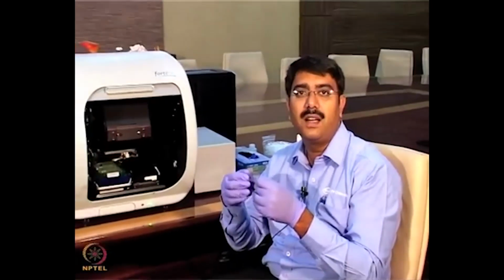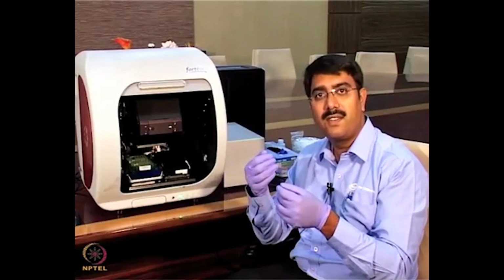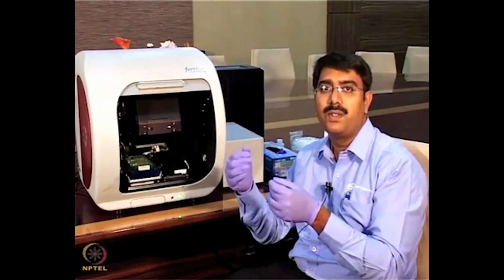The change in the wavelength, as the concentration increases, corresponds to the optical thickness. The greater the optical thickness, as seen from the change in the wavelength, the more molecules are binding. So from this we can determine the concentration. This instrument is useful for quantification. Say in industry, for any protein, if you want to do a quantification, we can take known concentrations of standards, generate a standard curve, and from that determine the unknown concentrations.